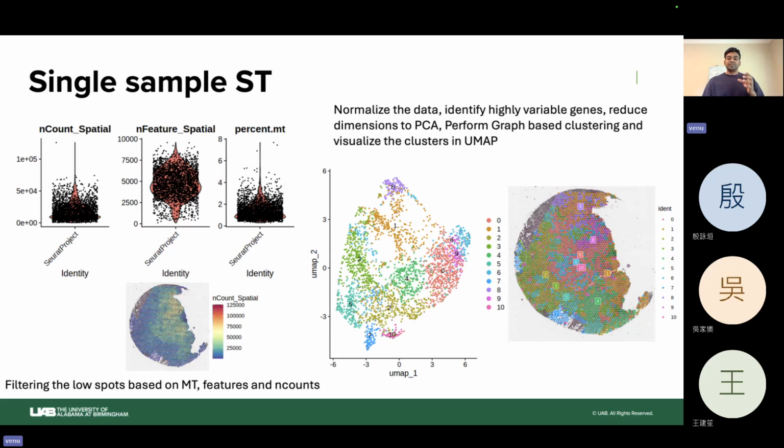That means each spot captures multiple cells. Suppose a spot is like 100 people: 70 are from India and 30 are from another country. So the majority of the population is what it takes. There are also subcells, so it counts how many of each are within the spot.